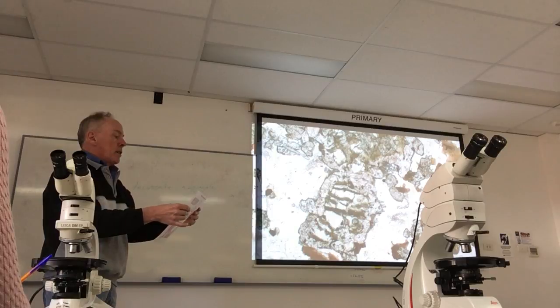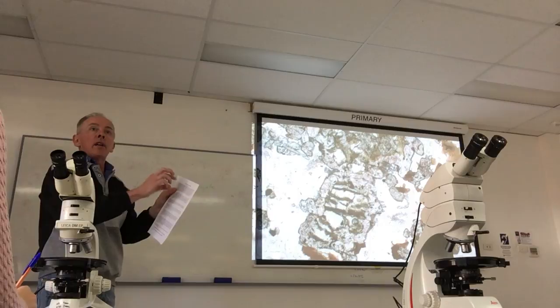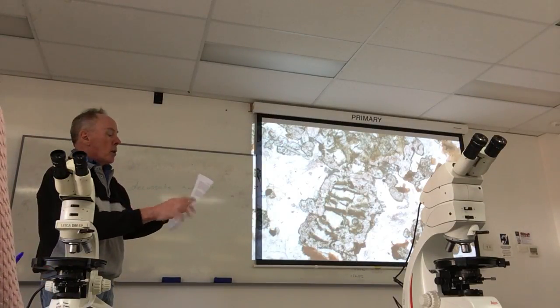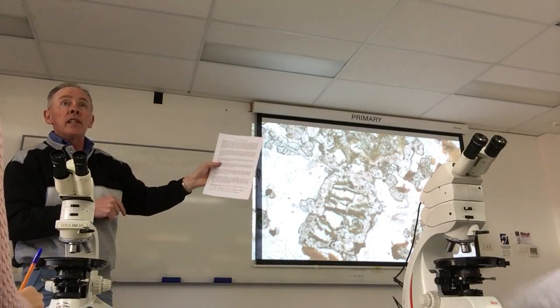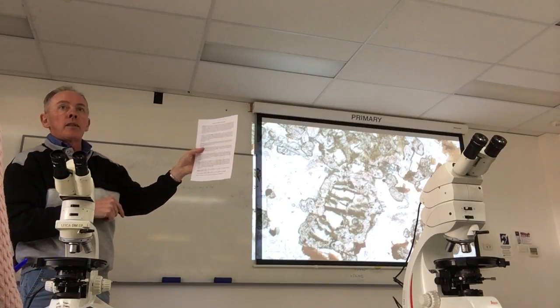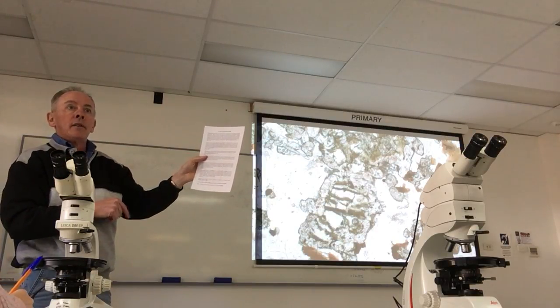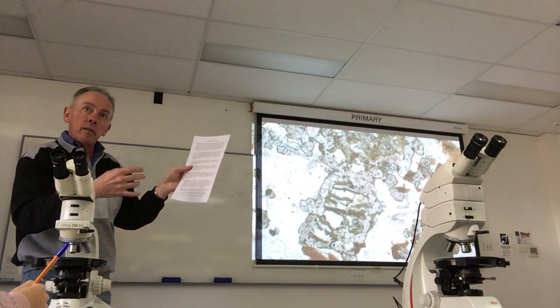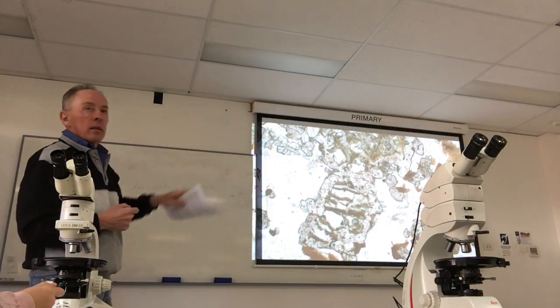I've written it, and it describes, importantly, the relationship between orthopyroxene and the other minerals, between hornblende and the other minerals. Hornblende overgrowing the outside of augite. Okay, that's really important. And I think students get lost, they can't see the forest for the trees, is the expression, when they're doing this sort of thing. So you need to identify your minerals first, but then think bigger picture. How do they relate to one another? Things like that are really important.